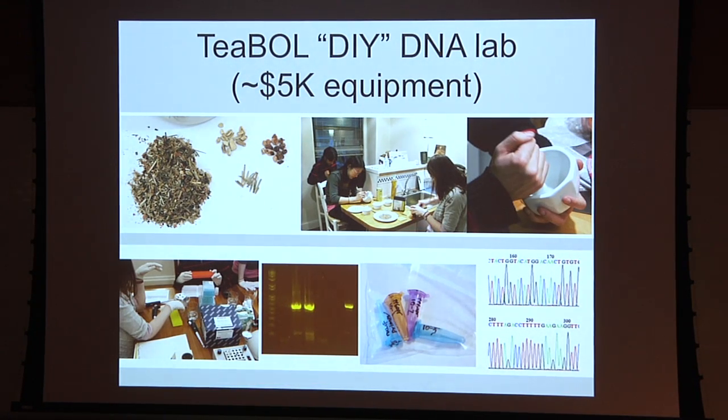Most samples were done at New York Botanical Garden. We did some of this in my dining room and kitchen. This is do-it-yourself DNA work. I guess you've been doing this the last few days, but we got a used thermal cycler, gel electrophoresis, bought a new QIAGEN kit, and did the DNA isolation at home.